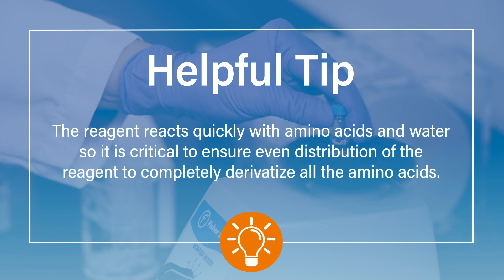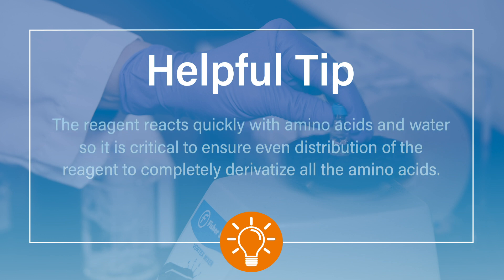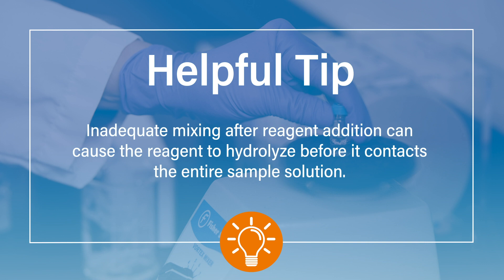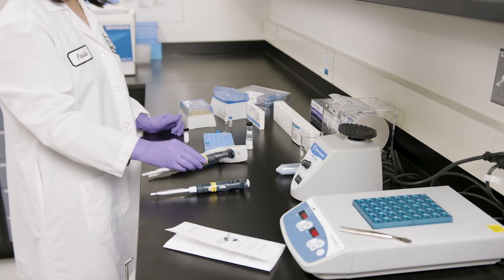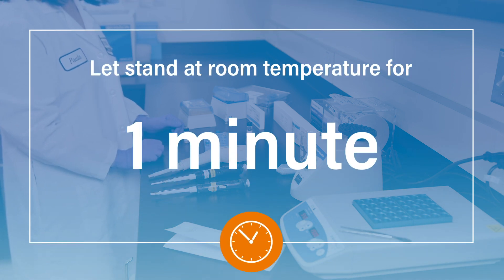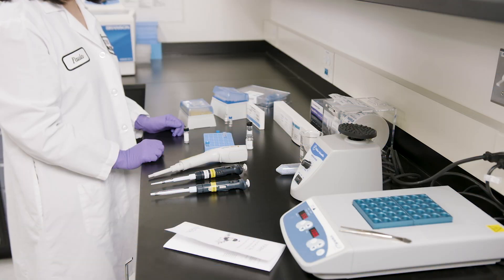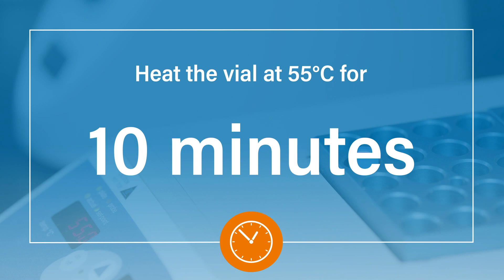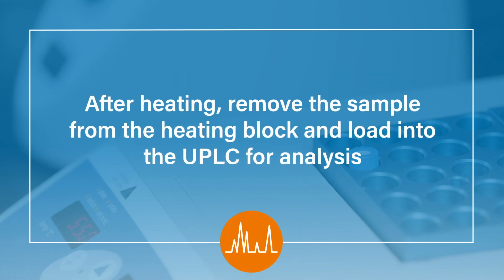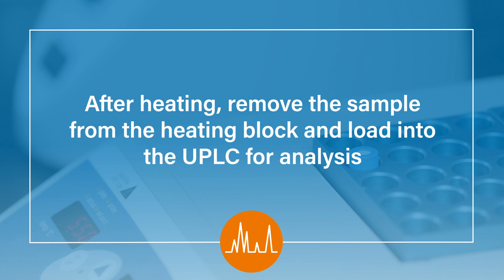Do not wait until after adding reagent to the entire sample group. Why? The reagent reacts quickly with amino acids and water, on the order of seconds. So it is critical to ensure even distribution of the reagent to completely derivatize all the amino acids. Inadequate mixing after reagent addition can cause the reagent to hydrolyze before it contacts the entire sample solution. Now let the sample stand for one minute at room temperature. Lastly, move the sample to a heating block and heat at 55 degrees for 10 minutes. After heating, remove the sample from the heating block and load into the UPLC for analysis.